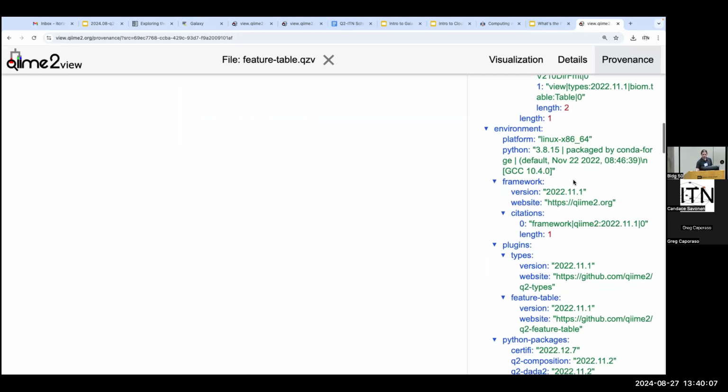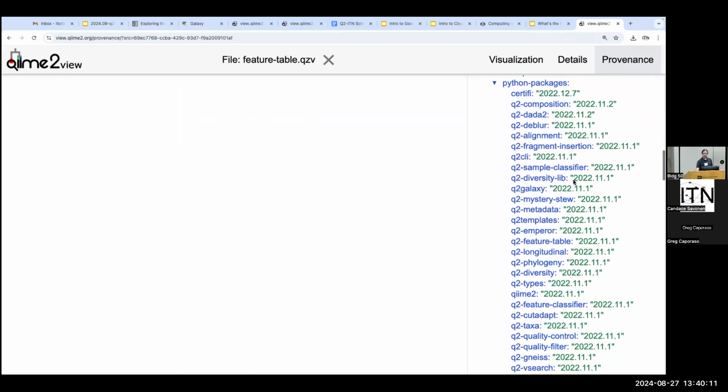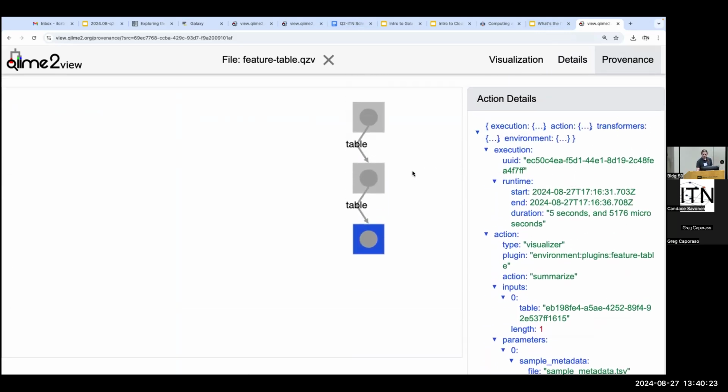There's just an enormous amount of detail in here. The vast majority of it you will never need to use, but that one piece of information that you are going to need is almost certainly going to be in here somewhere. If we were to trace this all the way back up, this is funny actually.